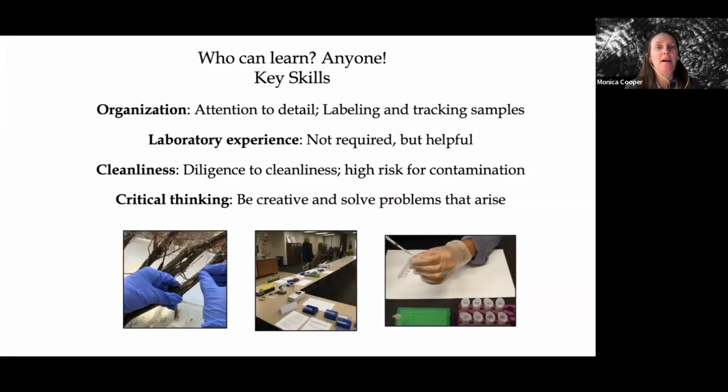One question that we get often is who can learn how to use LAMP? In our experience, anyone can. There are certain key skills that are really important, but this assay just takes a lot of practice and a lot of attention to detail in order to gain mastery. Key skills include organization. You need to be able to label and track your samples. You need to make sure that you put all the reagents in the appropriate tubes and added your samples, labeling things along the way.